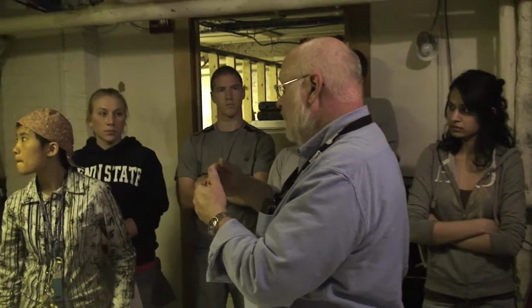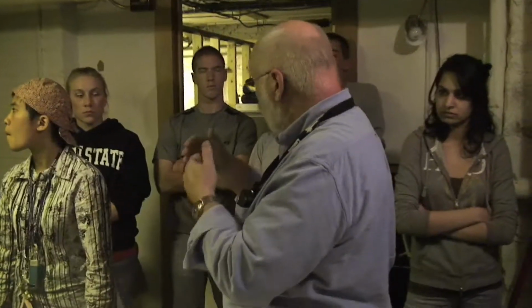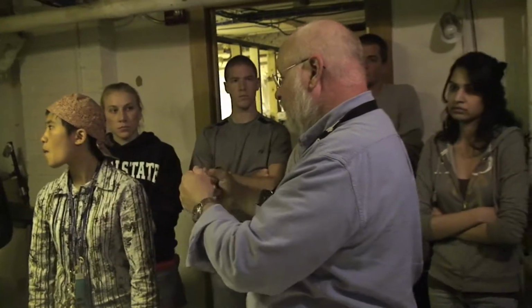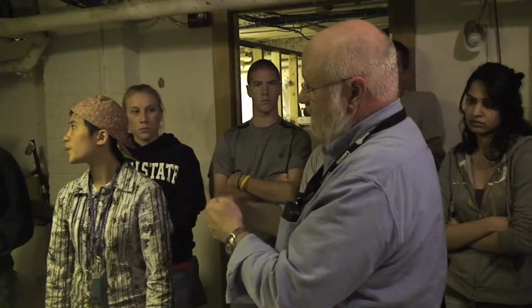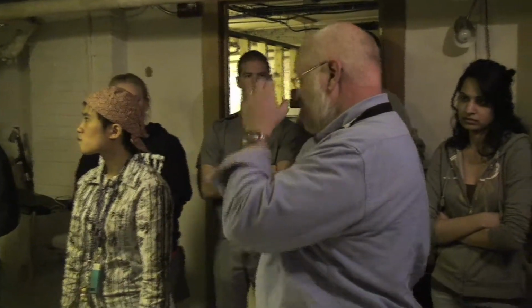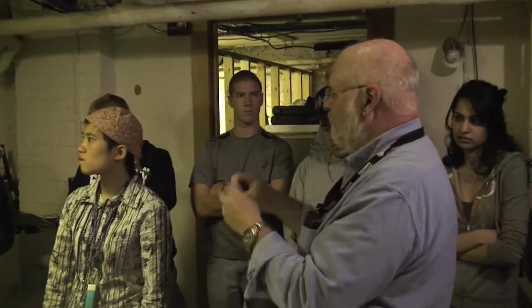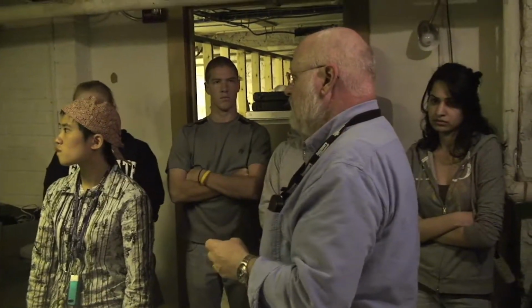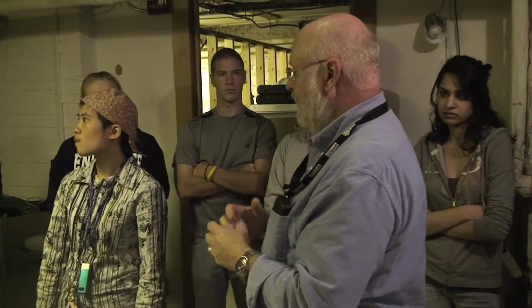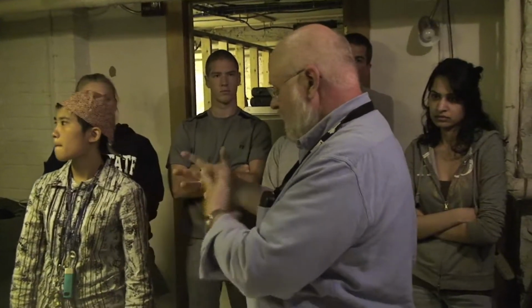The next step would be to use a chemical like DFO, or 1,2-indane-dione. And there are people who think that indane-dione and DFO are interchangeable. There are some who think that indane-dione is more sensitive, and some who think that DFO is more sensitive. There's a whole bunch of chemical formulations for making these reagents, and the most recent formulation for indane-dione is to put zinc in the solution, and people think that works better.